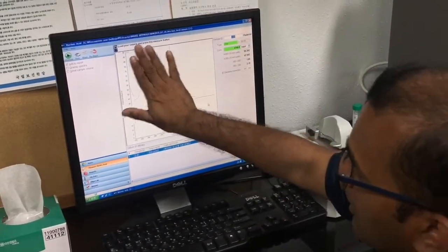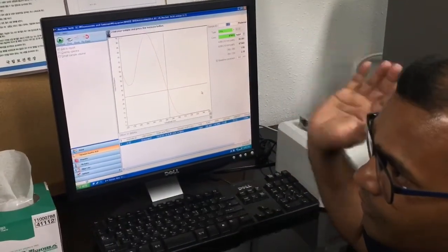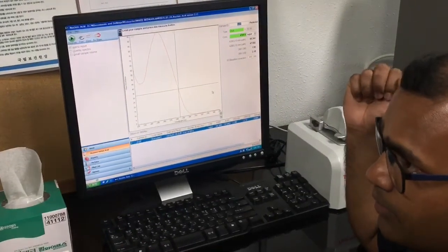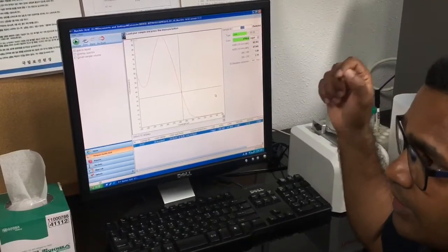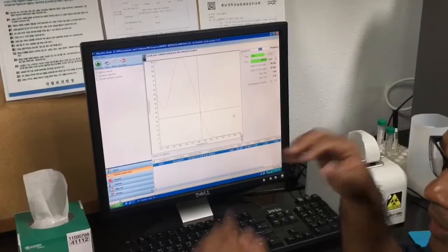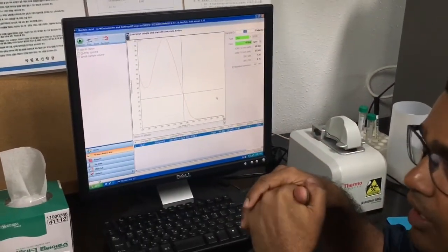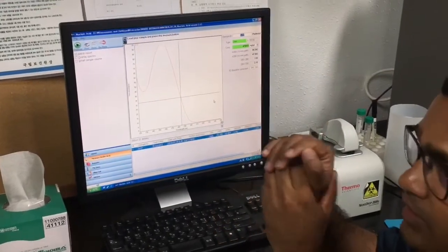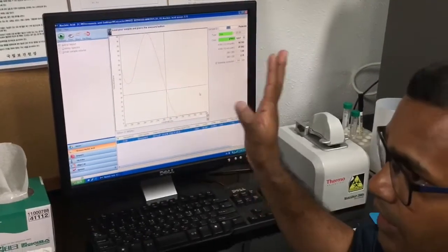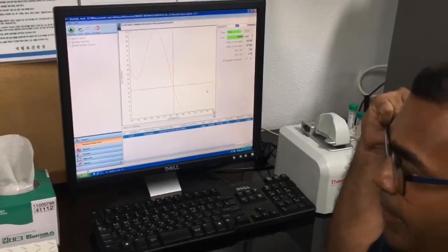So we are taking this basic information, and we also confirm by agarose gel. We load 1 microliter of the DNA with 5 microliters of loading dye, and see how nice the DNA band is. Sometimes it smears and sometimes it's broken, and we see how the conditions are in the agarose gel also. We first take the measurements in here, and then confirm the DNA through the agarose gel, right?